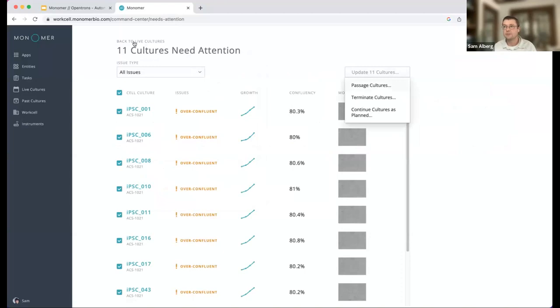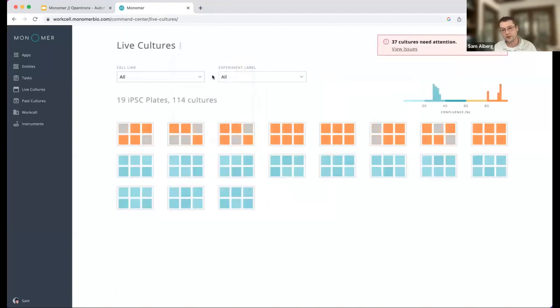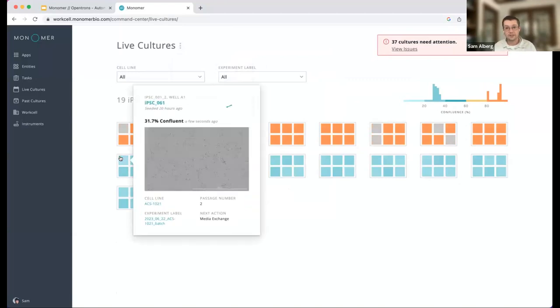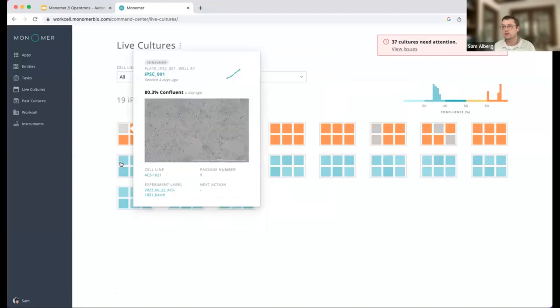And again, this is communicating down to the work cell layer. It's going to execute a passage routine like the ones we've talked about, Carter just spoke about, on the Opentrons. And after it does it, it's going to seed a full new six-well plate from that one consumed well. So those wells that are passaged are marked as consumed.